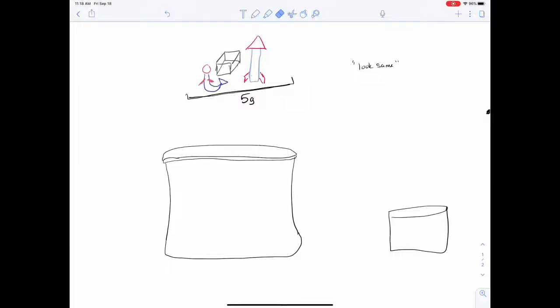In this lab, we're going to separate 3 different chemicals so that it's easier to visualize. I have the chemicals represented with a mermaid, a cube, and a rocket. The 3 different chemicals have different properties that we're going to use to separate them. This rocket right here, just like in real life, we're going to make it fly off from the mixture.